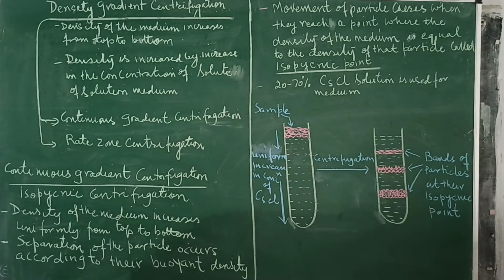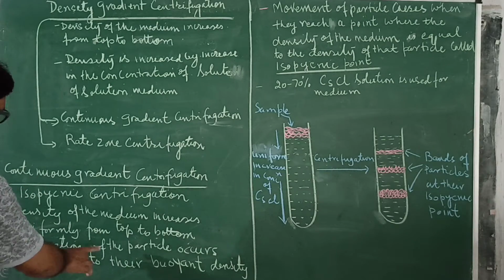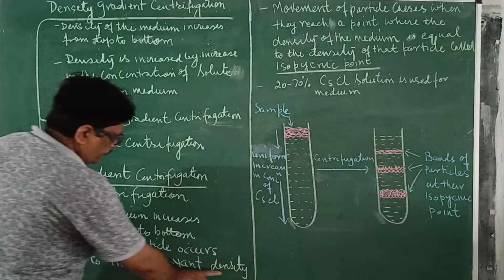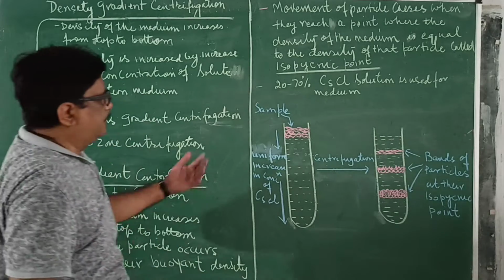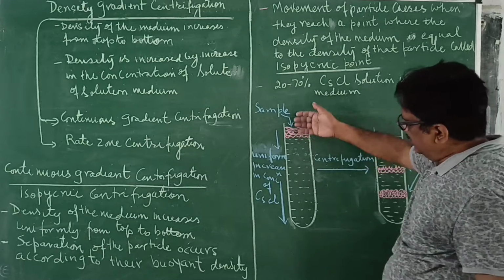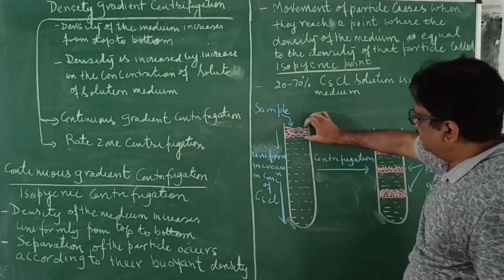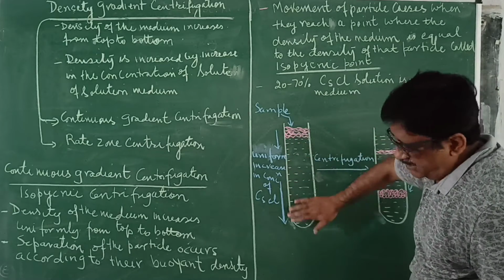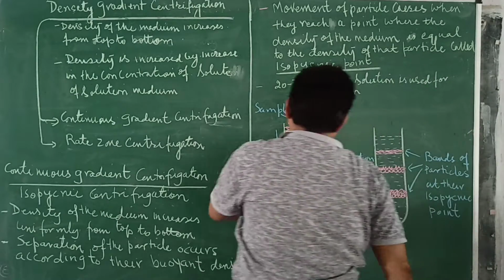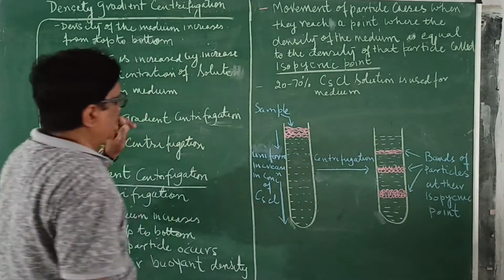Another point is that the separation of particles occurs according to their density. Particles of different densities will move different distances, and they will get separated.